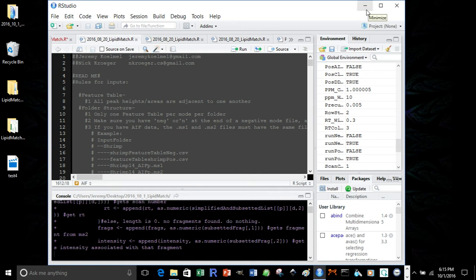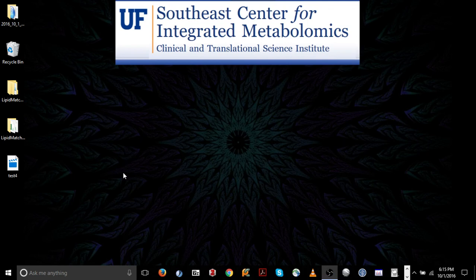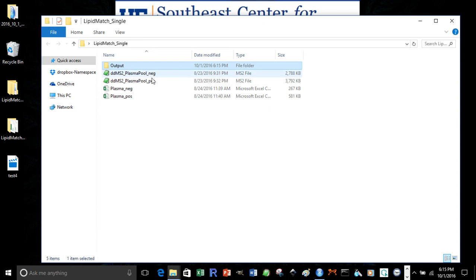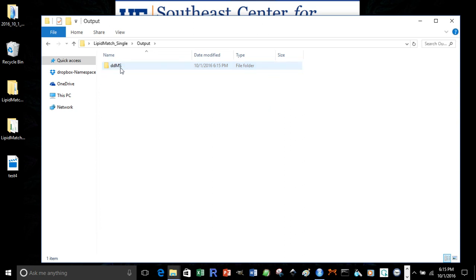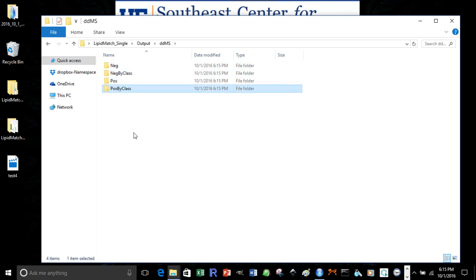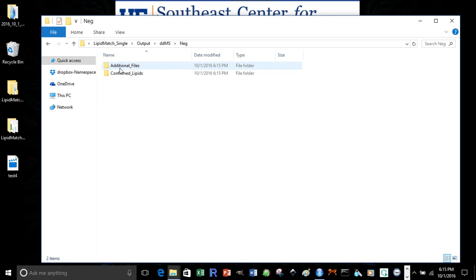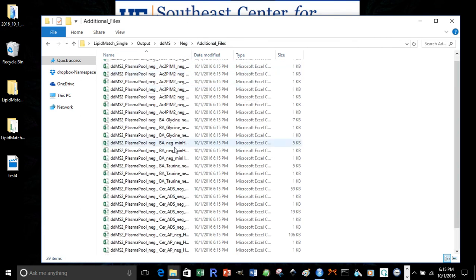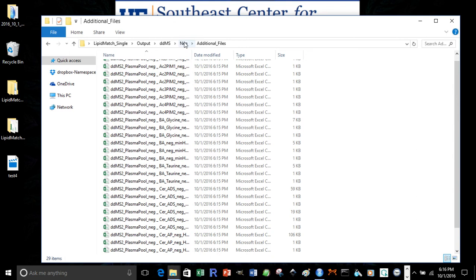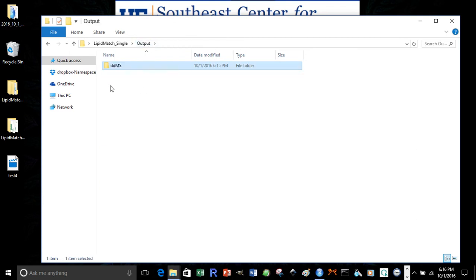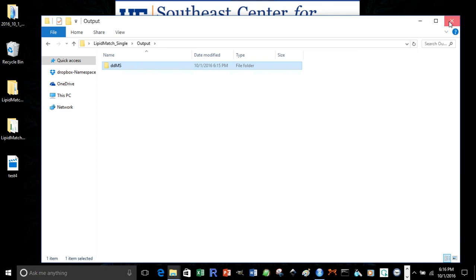Another way to know how far lipid match has run is to go into your lipid match folder. As you can see here, an output folder has been generated. And that folder is your data dependent for neg neg by class, pos pies by class. It goes in this order in which it performs identification. So we start at negative mode. We can see in the additional files that it has run these classes so far. Once all of these folders are completely populated, then it will generate the final files, which I'll discuss in Lipid Match Tutorial Part 4. Thank you, and looking forward to seeing you in Lipid Match Tutorial Part 4.